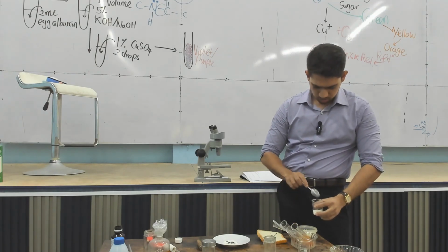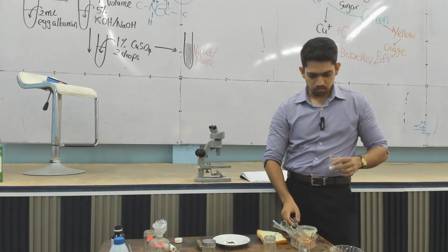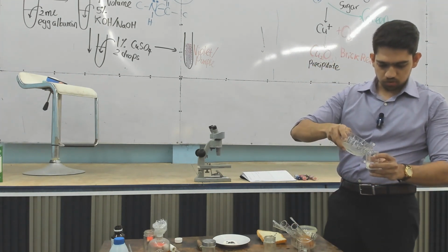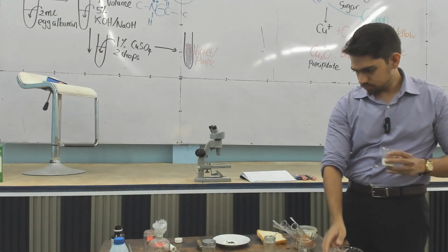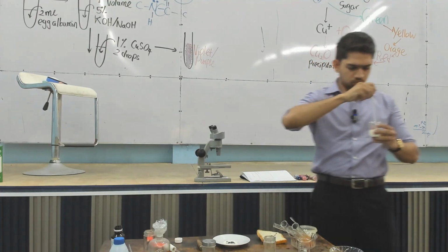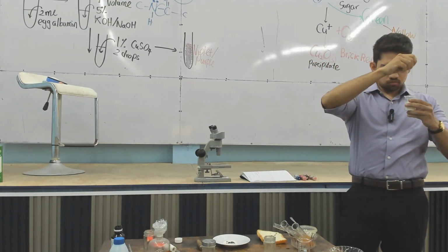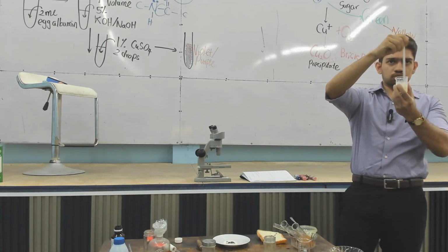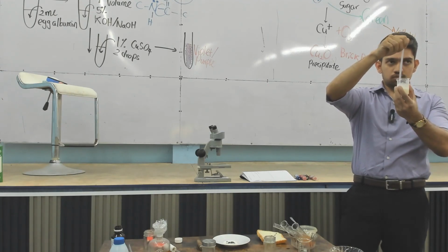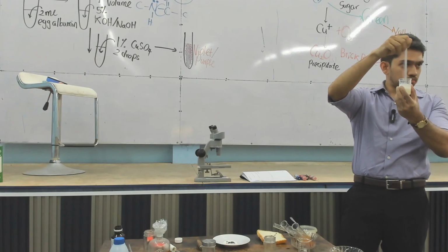So starch, it doesn't dissolve very well, okay. So it's going to be a sort of a colloidal solution. Okay.